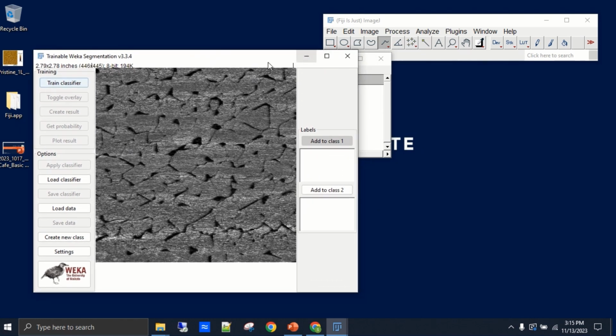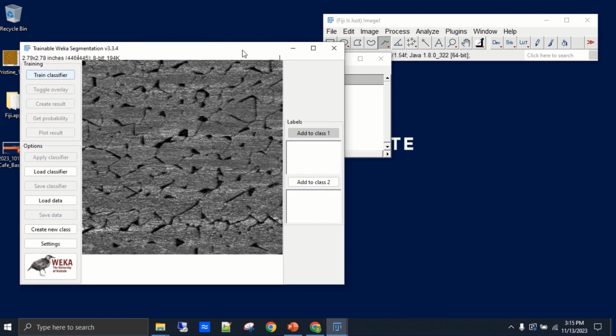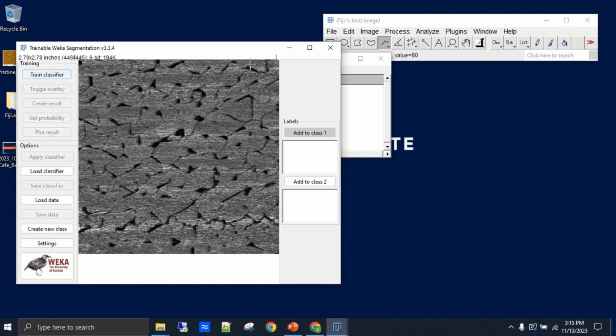What I'm going to do is draw regions around features of interest, and then define that to a particular class. So you can use this freehand tool, and I can just kind of draw in this triangle as one region of interest. And really, this is where you want to do your best to draw in as much of an area as you can with varying kinds of backgrounds.